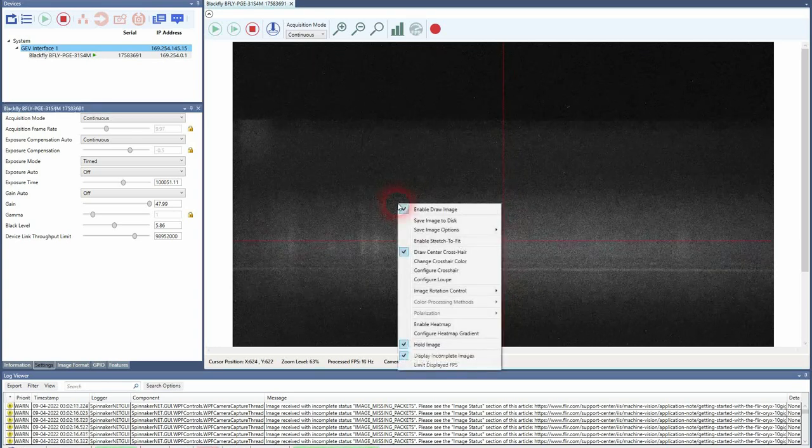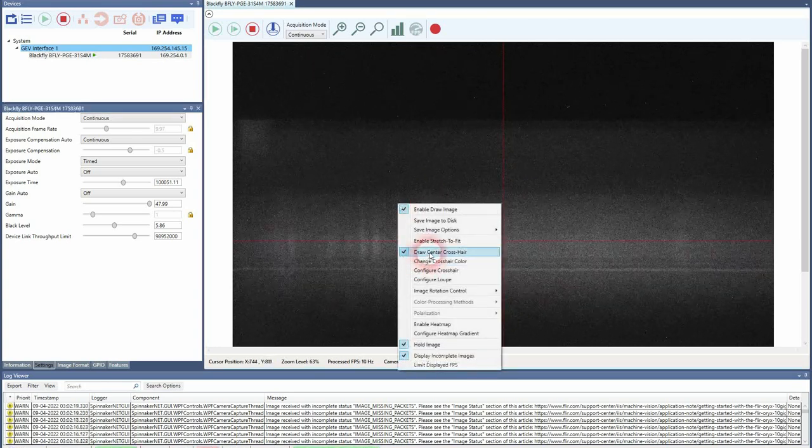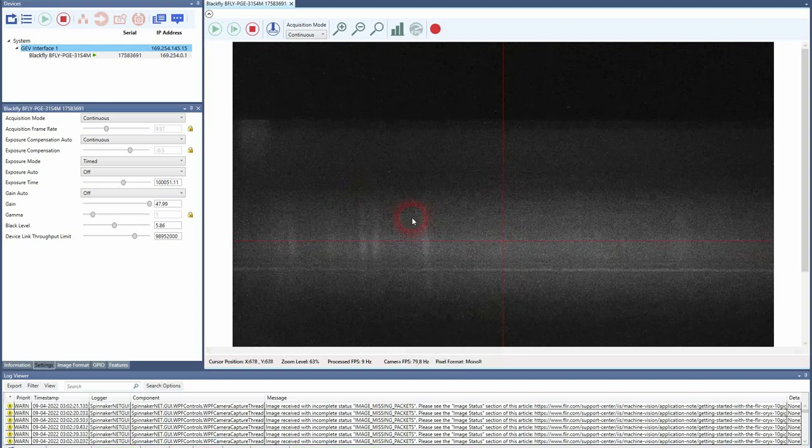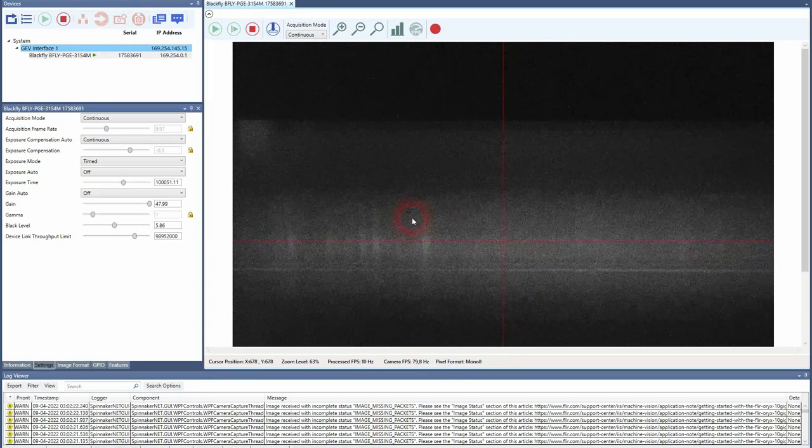If you don't have the crosshair, check that you have the draw center crosshair enabled. This is really important for the alignment.